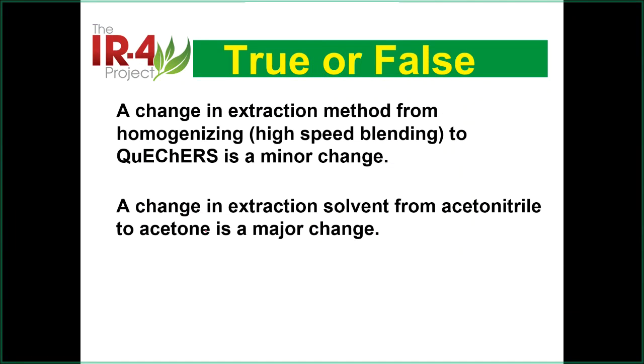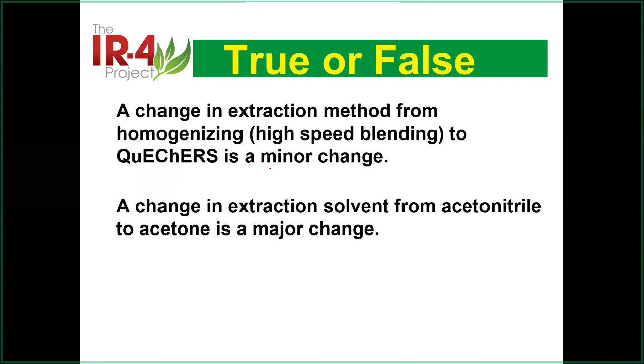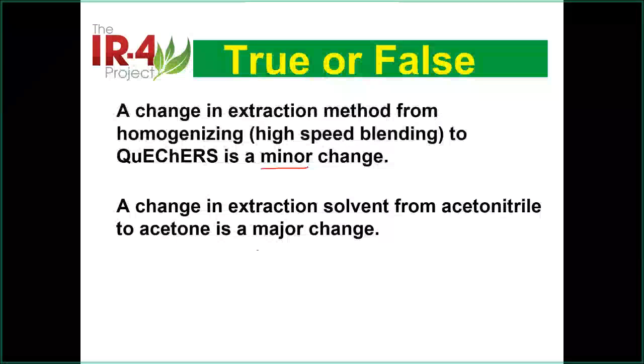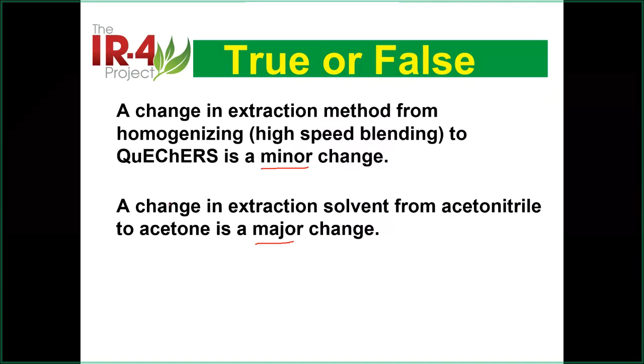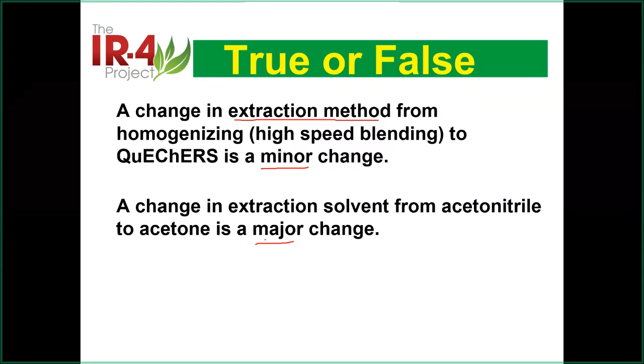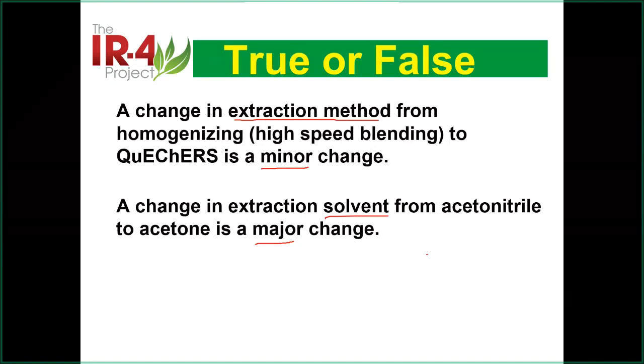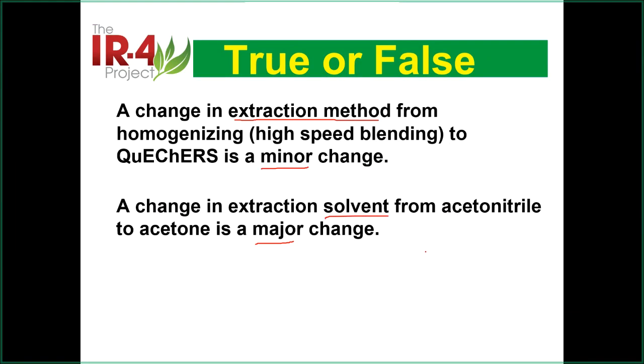For example, we talk about changes. Is this a minor change or a major change? In this case, for example, if we change the extraction method, is it minor or is it major? Or if you change the solvent, is the change bigger or small? I'm not going to talk about this now. If we have time, we can talk about this at the end of the presentation.